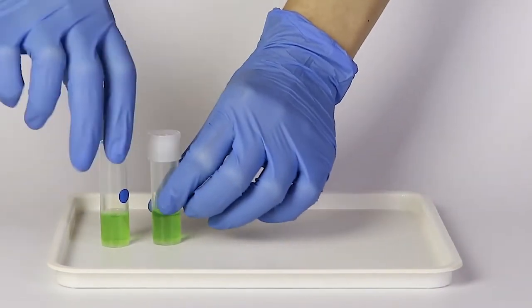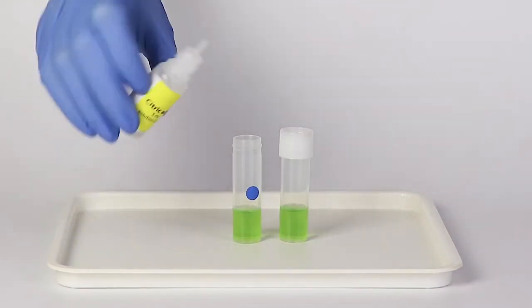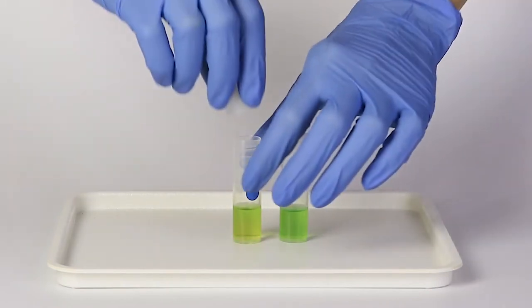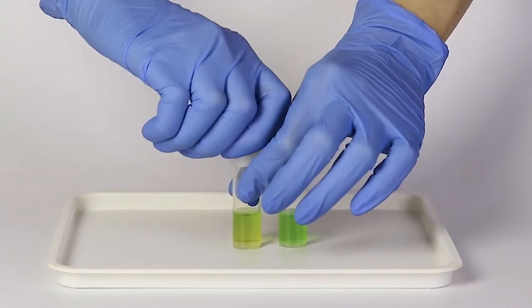Cap the vial without the blue sticker. Add 15 drops of the citric acid solution to the vial with the blue circle. Then cap the vial and shake it.